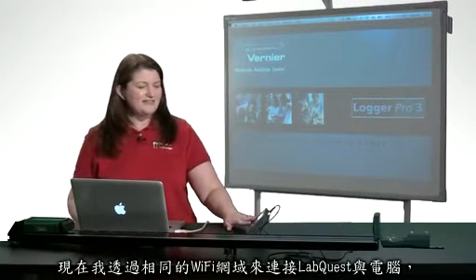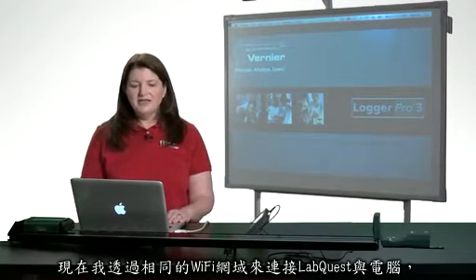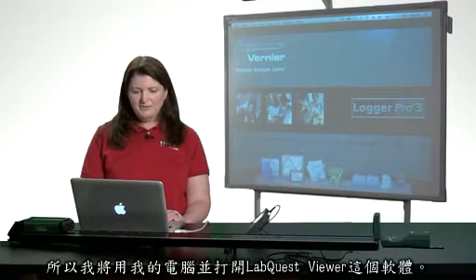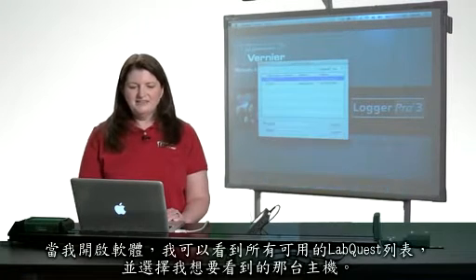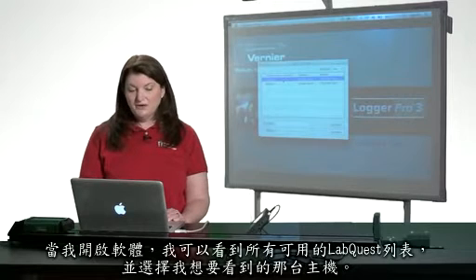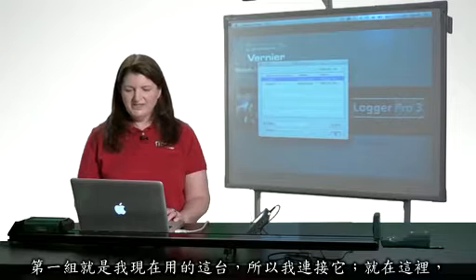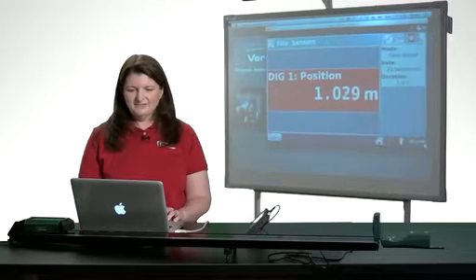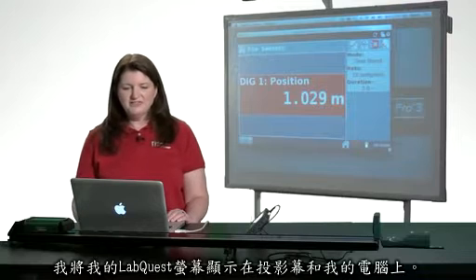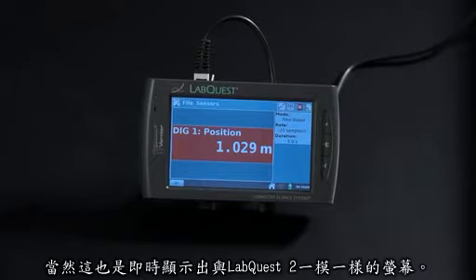Right now I have this LabQuest connected to the same Wi-Fi network as my computer, and so I'll go to the computer and launch my LabQuest Viewer software. When I do that, I see a list of available LabQuests and choose the one I want to see. Group 1 is the one I'm using right here, so I just say connect. And there it is. I have my LabQuest screen displayed on the projector screen and on my computer. It's the same screen you're seeing in real time as on the LabQuest 2.